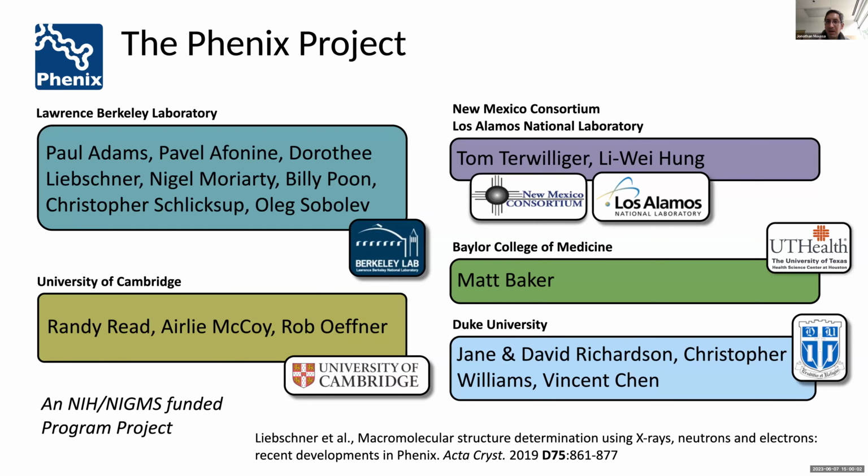So in these pockets, is all the water believed to be accounted for and relatively locked in place? Or can there be instances of fractional locations or itinerant water that leads to uncertainty in this type of analysis?